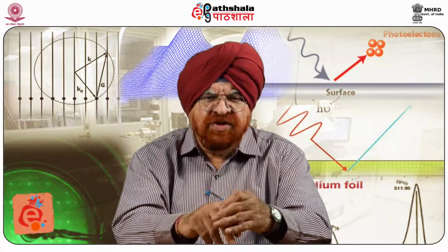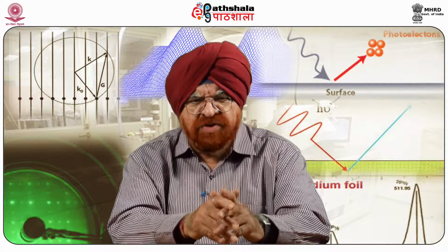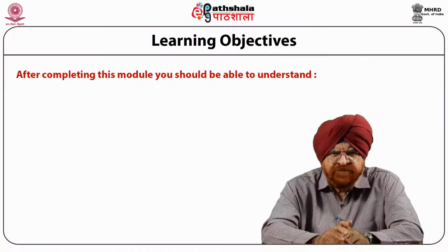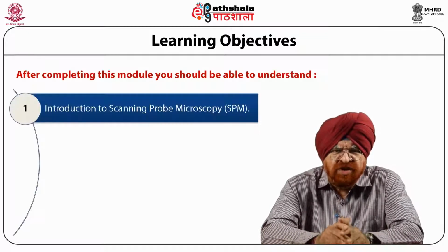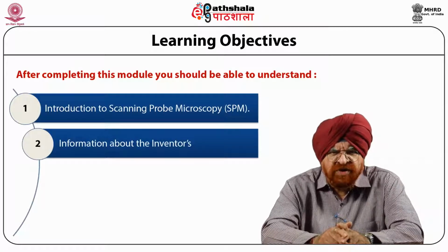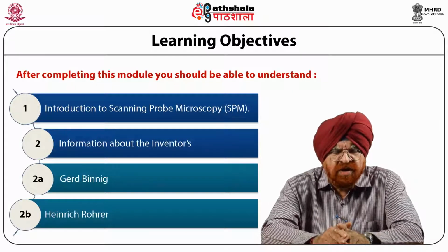Today, we are going to discuss the module Atomic Force Microscope or Microscopy as we call it. In this module, we'll deal with the introduction of this particular technique, which comes under the paper of Surface Analytical Techniques Part 1. After completing this module, you should be able to understand the introduction to scanning probe microscopy, and information about the inventors, that is Gerd Binnig and Heinrich Rohrer.